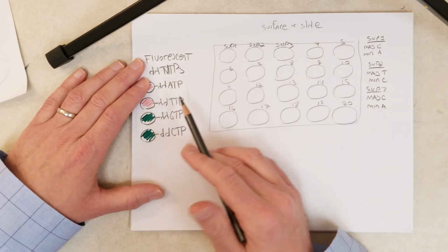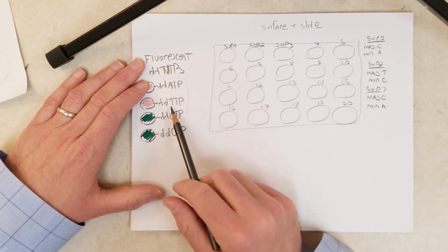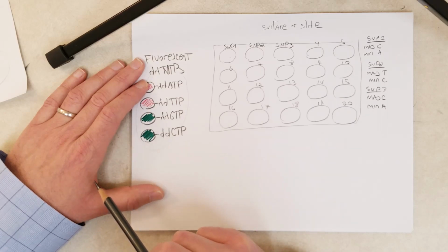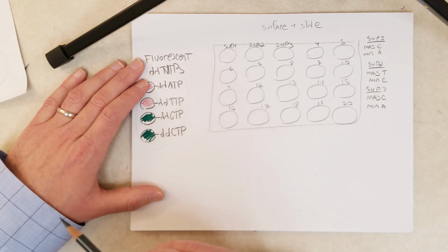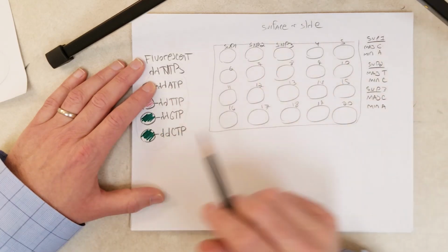So what we need to do is let the polymerase add the ddNTPs, one to each SDO based on John's genotype. It'll extend the SDOs by one position only, because these are ddNTPs. They're chain terminators. And then we can wash off everything.